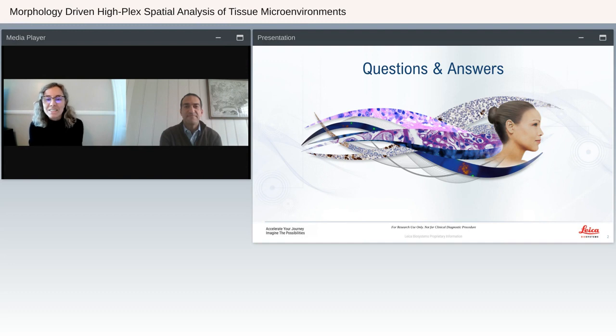Great. And it looks like our second question is, how many genes can [be profiled with the whole] transcriptome?